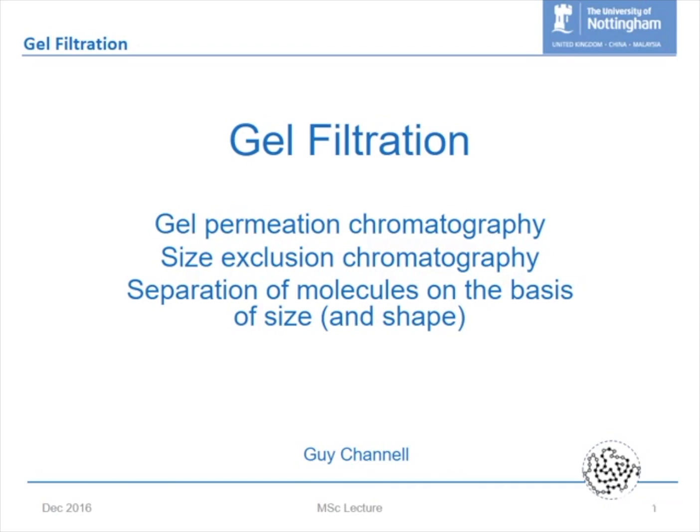But what we'd like to do this morning is we're actually going to put gel permeation chromatography in the context of other chromatography. And then I'm going to describe the separation process in terms of elution volume. We're going to be able to characterize something called a partition coefficient. And from that partition coefficient, it's called KAV, we're going to calibrate a column, pretty much like what you can see in front of you here, in terms of running standards on that column.